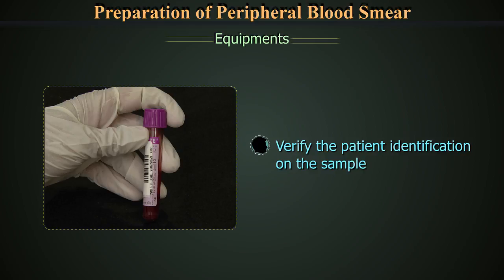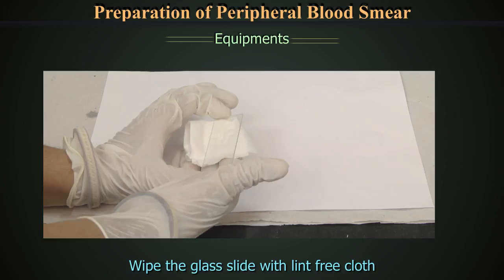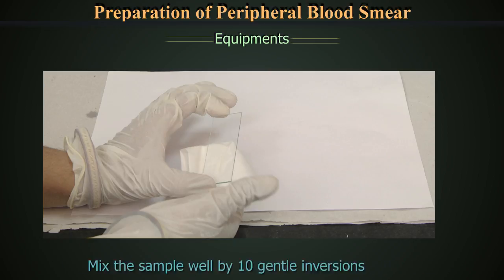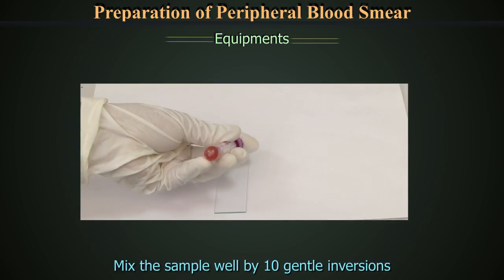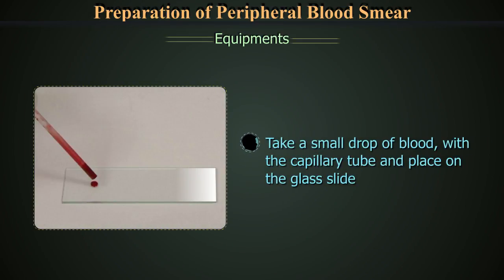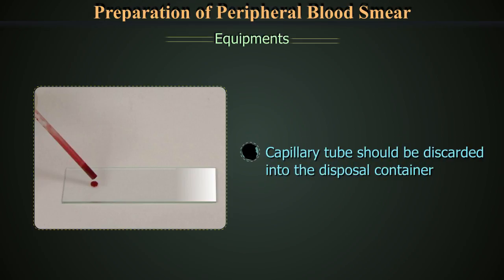After getting the equipment ready, verify the patient's identification on the sample. Wipe the glass slide with lint-free cloth to clean any crust immediately before making the smear. Mix the sample well by 10 gentle inversions. Take a small drop of blood with the capillary tube and place it on the glass slide, 1 cm inside the opposite end to the frosted one. The capillary should be discarded into the disposal container.